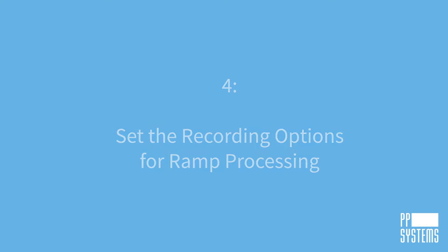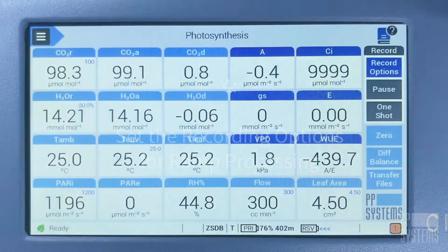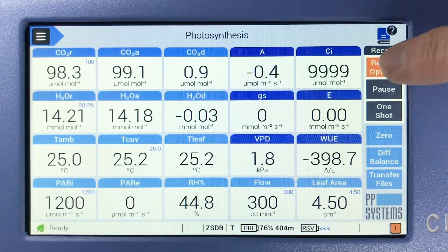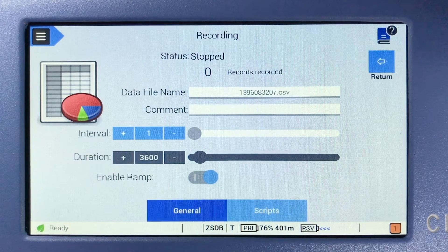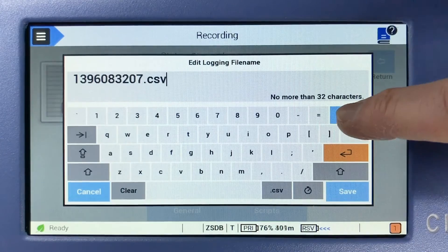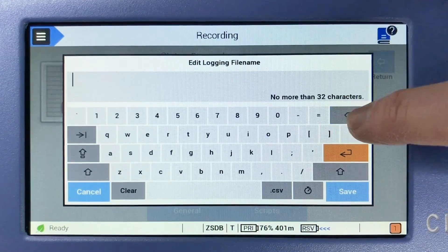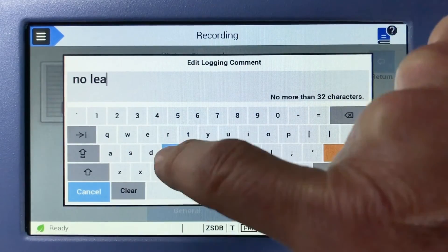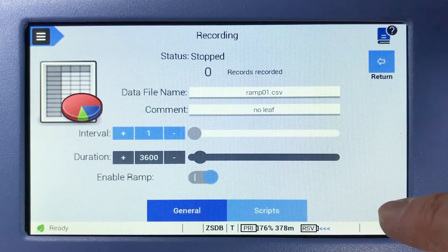Now, let's set the recording options for ramp processing. Navigate to the main measurement screen, Measure Photosynthesis, tap Record Options, and tap the Enable Ramp toggle so that a 1 is visible indicating that it's enabled. The interval will default to 1 second. Tap the Date of File Name white box and enter a file name, and the comment box for any relevant notes. Then tap Return.